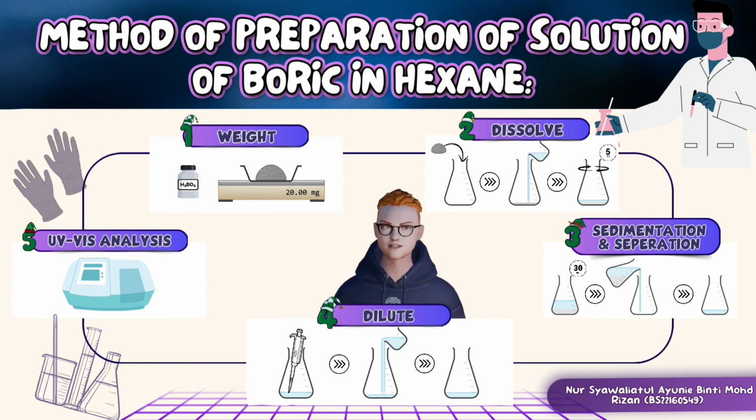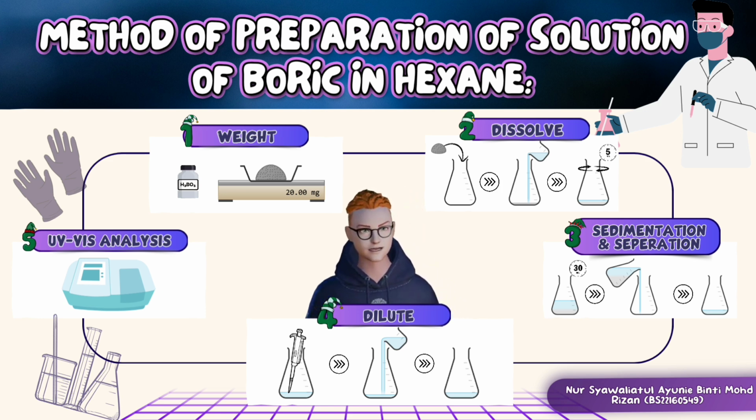Then, the supernatant, which is the clear solution, will be carefully separated from the sediment. Last but not least, 200 microliters of the supernatant was taken to dilute it with hexane up to 3 ml. The solution was then ready for the UV-vis analysis.